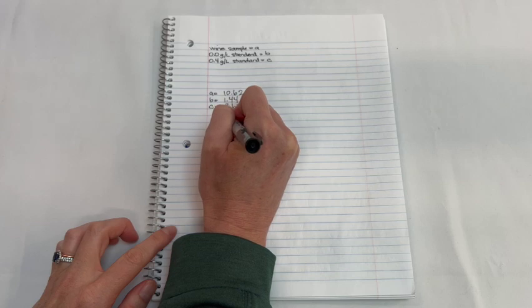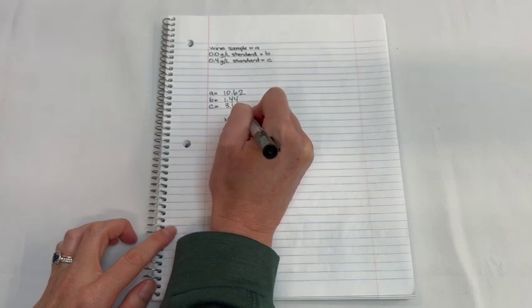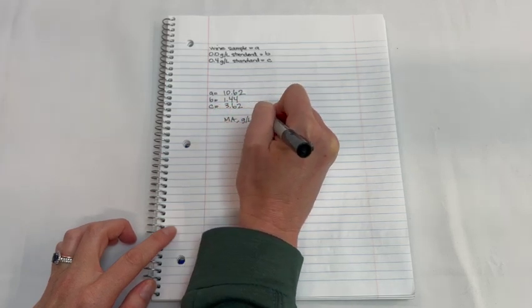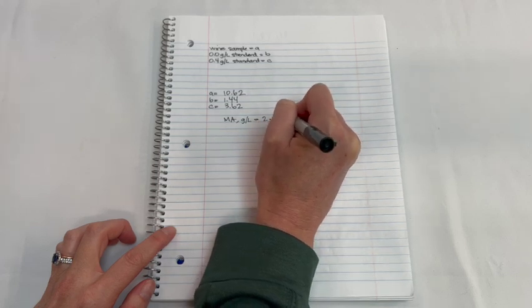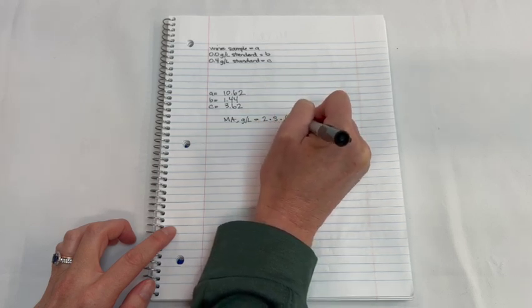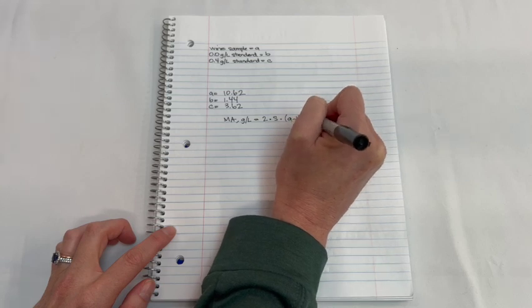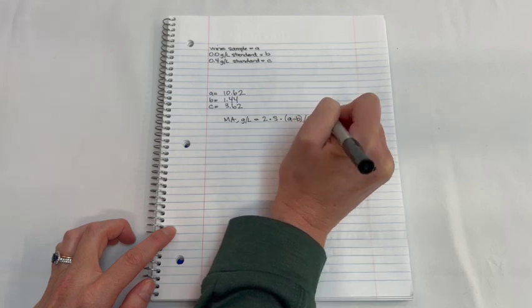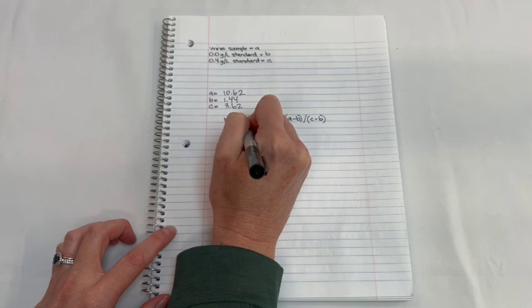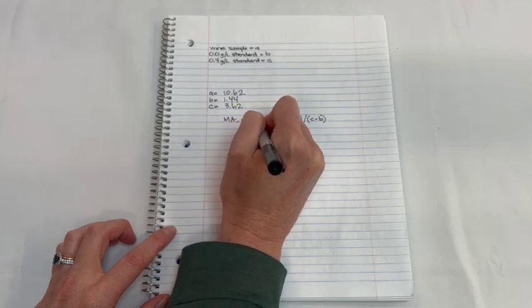Since we ran our standards, we are going to continue on with the quantitative mode procedure. Our wine sample values will be called A, our 0.0 gram per liter standard will be B, and our 0.4 gram per liter standard will be C. And we can calculate our malic acid concentration as follows.